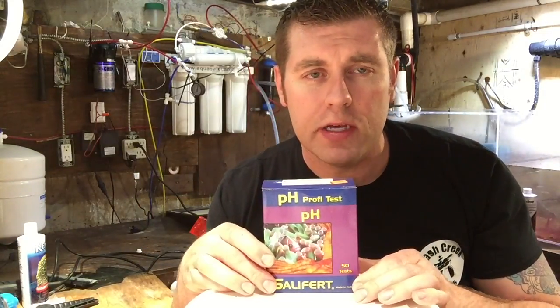You always want to try to keep your pH between 7.8 and 8.0. That's your ideal mark that you want to keep your pH in your reef tank. So let's get started — I'm going to unpack this and show you guys how to do this.